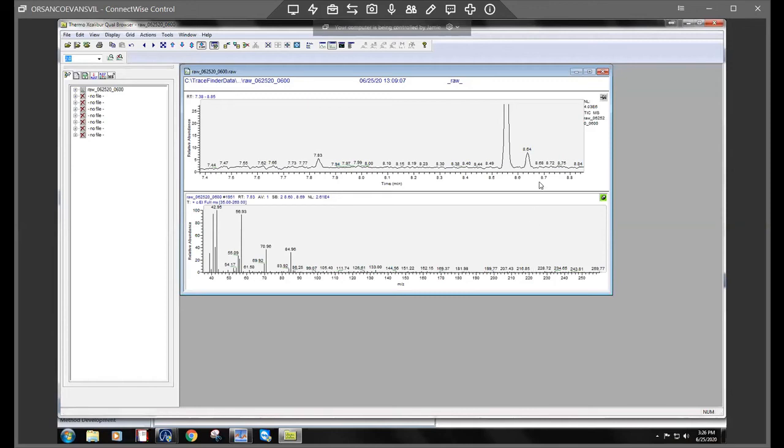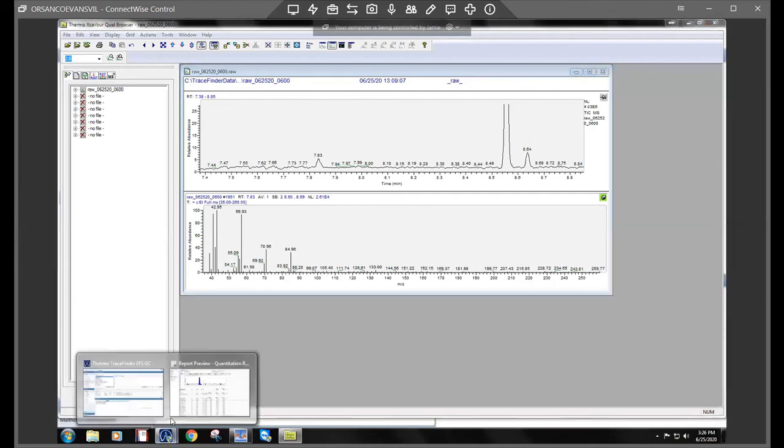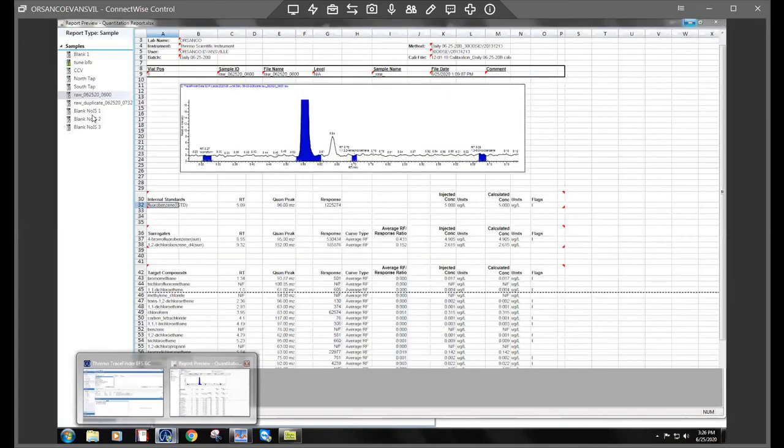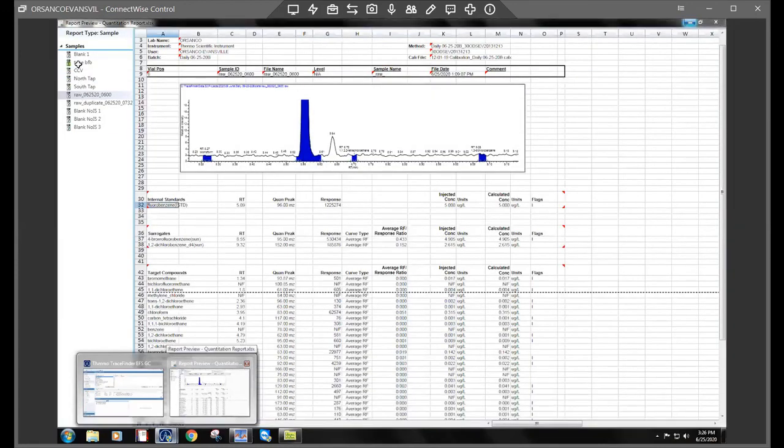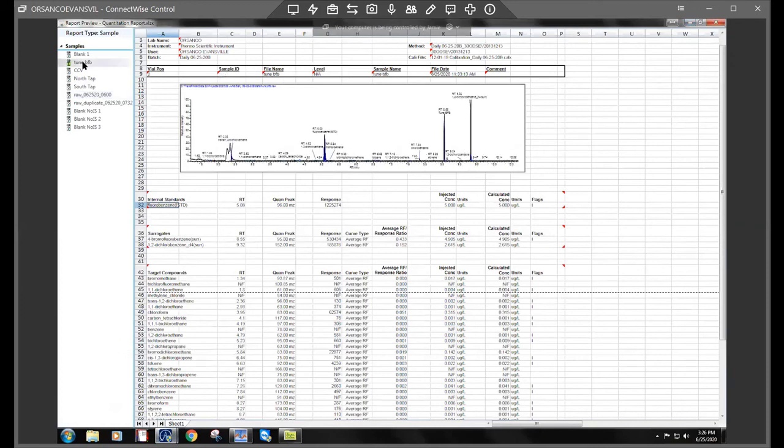So decane is used as an industrial solvent. So chances are it probably got in at some point and just contaminated the column. And the main reason I would say that is because if you pull up the other samples from that, even that same run and previous runs, we tend to still see these compounds.